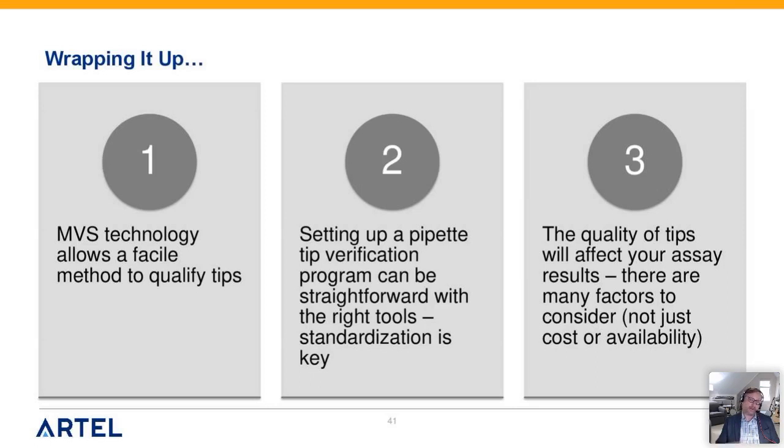So you can take that and implement it lab to lab and get the same results over and over, comparable results. And we've talked about this, the quality of the tips will affect your assay. That is a known fact. There are a number of factors to consider, not just cost or availability. We need to make sure that the performance is appropriate.